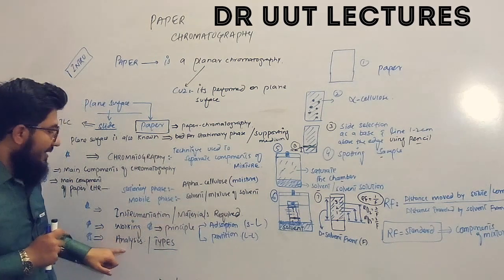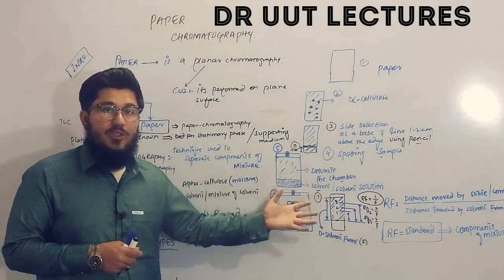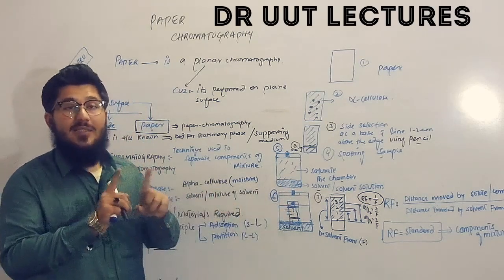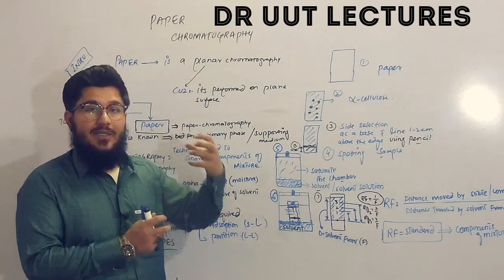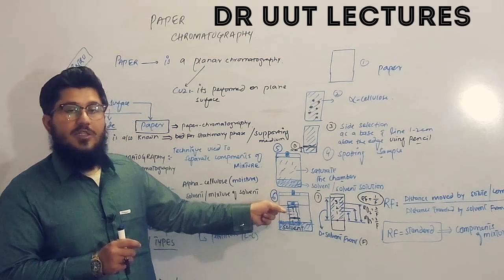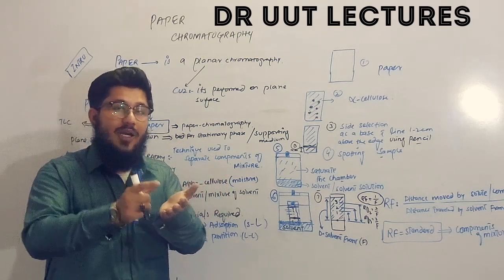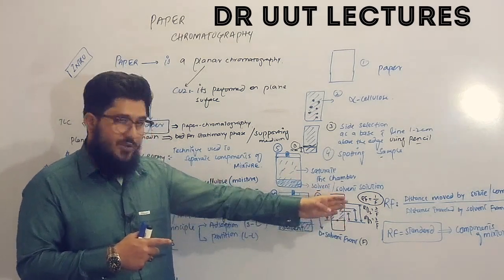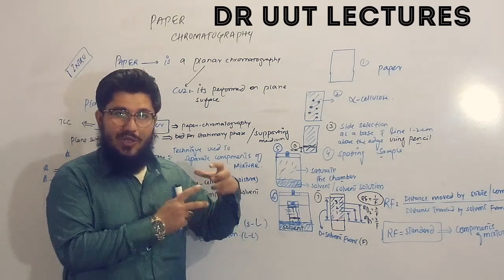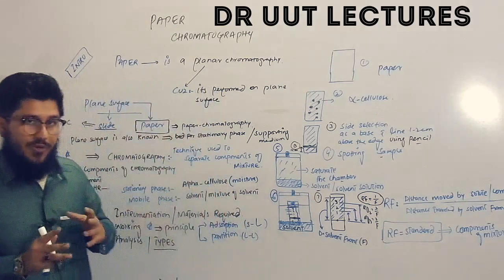The next point is the analysis. We can do the analysis of different types of compounds. There may be colored, maybe non-colored. And this is the particular way through which we analyze the colored substances. Consider if we have a colorless substance sample, which we are going to analyze. For that, what will we do? We will just wait for a particular time. After waiting, we will take our stationary phase out. But those will not be visible to the naked eye. Then we will apply a light on that. After that, the same procedure is performed as we did for the colored one. So this is how we separate both the colored and the colorless mixtures, and we analyze. So we can do the analysis of different samples and different products. They may be colored, they may be non-colored. So we can do both types.